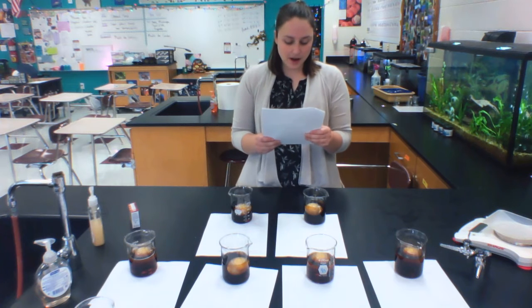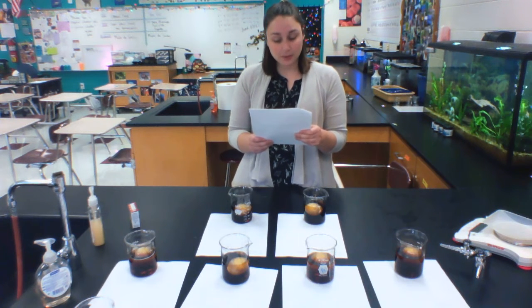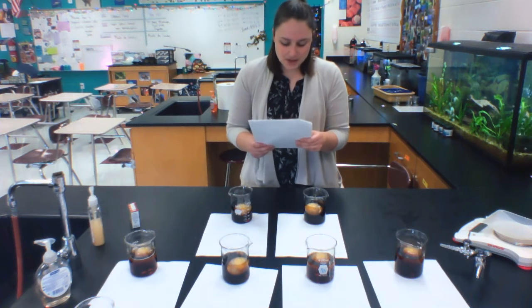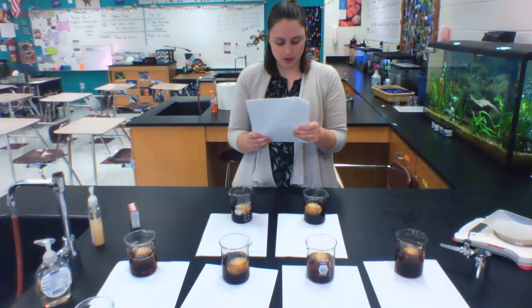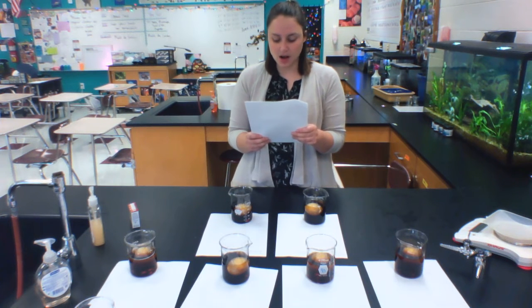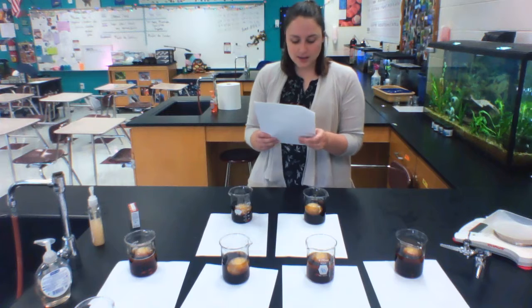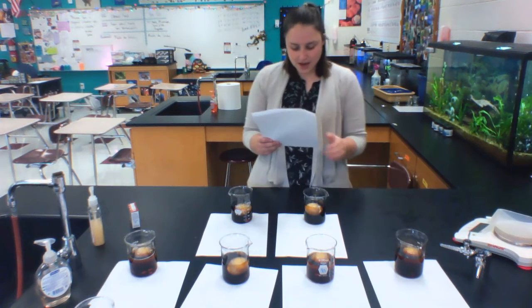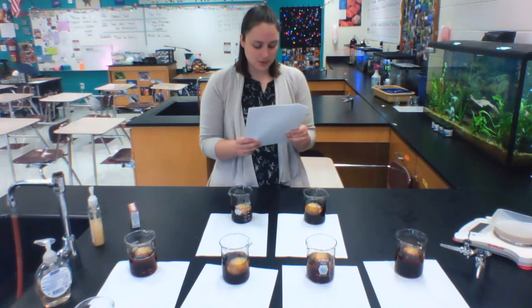Then pour the syrup out into the sink with plenty of water to rinse it down because it is kind of sticky. Then we'll rinse the beaker and fill it halfway up with water. Next, we'll carefully place the egg into the beaker to rinse off some of the remaining syrup. Then we'll rinse the weigh dish. Remember, this is a weigh dish. And dry the weigh dish with a paper towel.